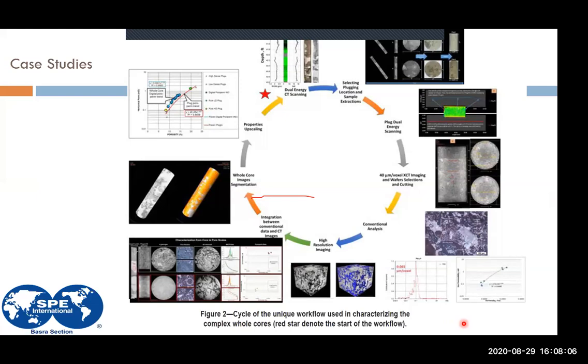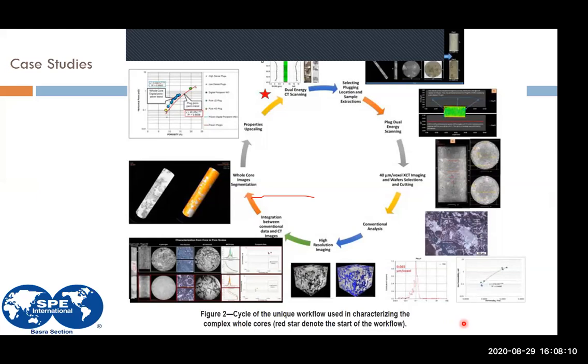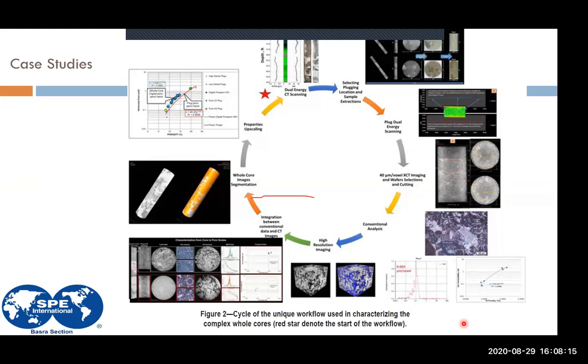So it's also part of the digital rock technique to perform this plug selection in a digital way. It's a digital selection, and then you can discuss with the geologists, with your team, and see if it's okay. And then you can plug the real core. Here it's just a digital plug.